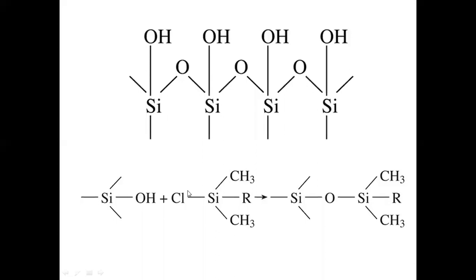As I have already explained under the gas chromatographic technique, the chemical treatment will be done by treating the stationary phase with reagents such as dichlorodimethylsilane or hexamethyldisilazane in order to get disilyl ether. This is a disilyl ether. And this chemical treatment will also be followed by washing the stationary phase with an acid or alkali in order to remove the trace metal impurities.